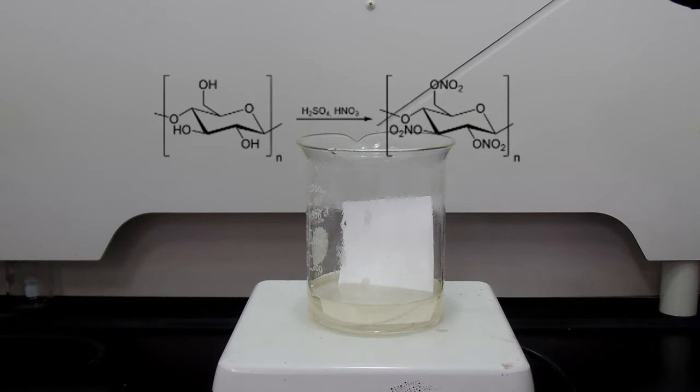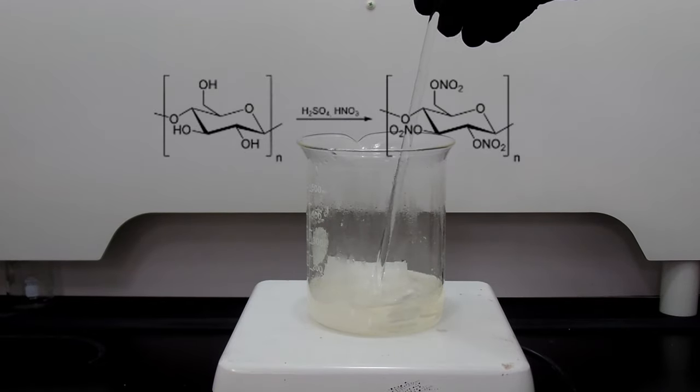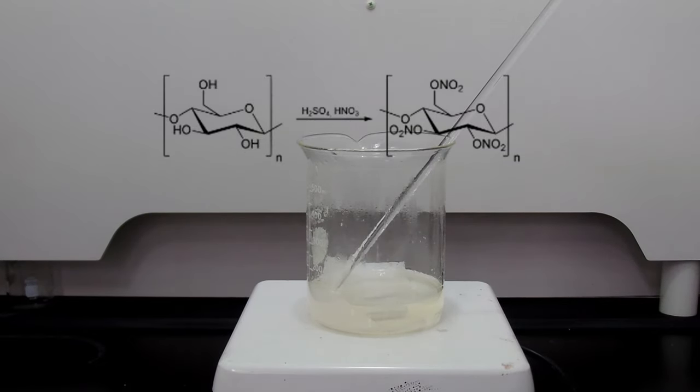What is happening is that the nitric acid is converted to nitronium ion under the strongly acidic conditions of sulfuric acid. And the nitronium ion is the active species that nitrates the hydroxy groups of the cellulose.